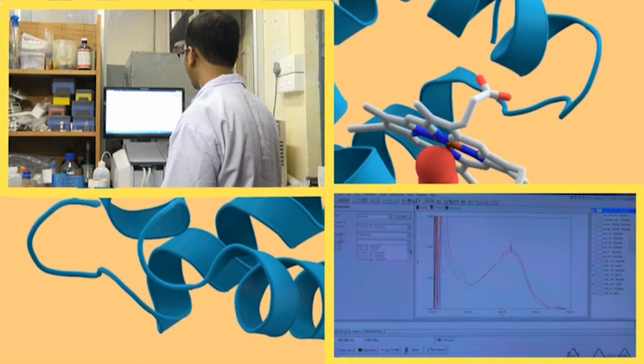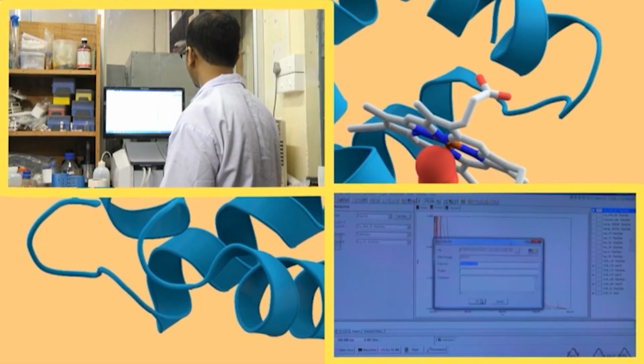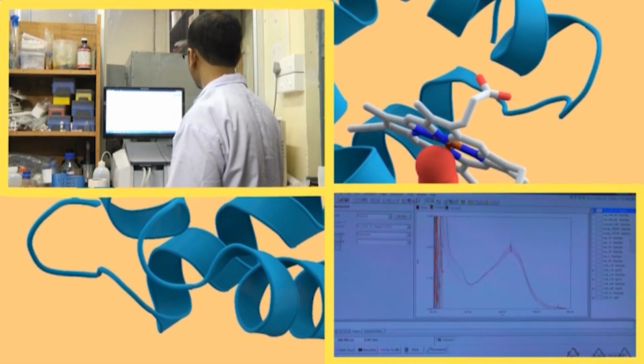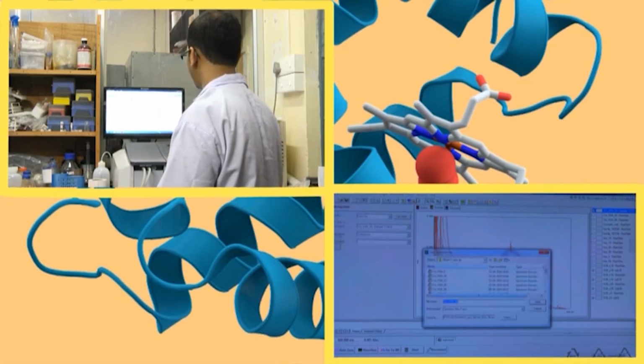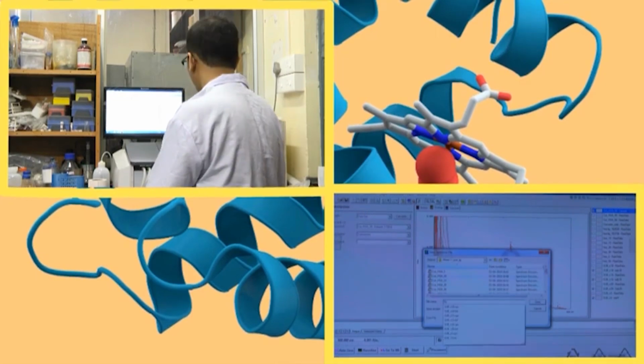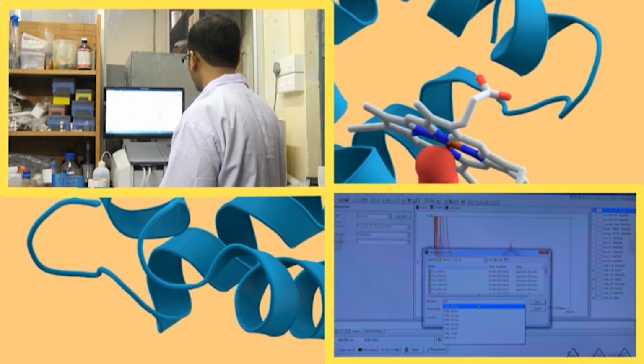Curcumin HSA 30, subtracting from HSA 30, calculating it. We are saving it again as SUB C 30.